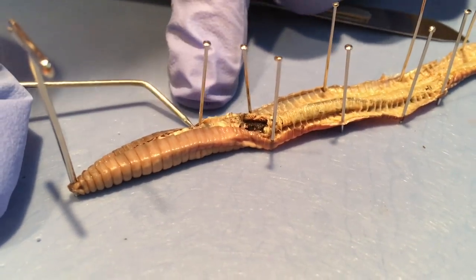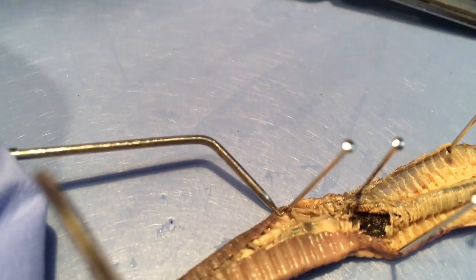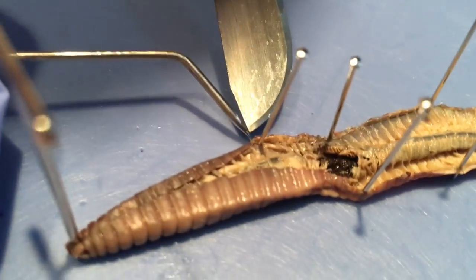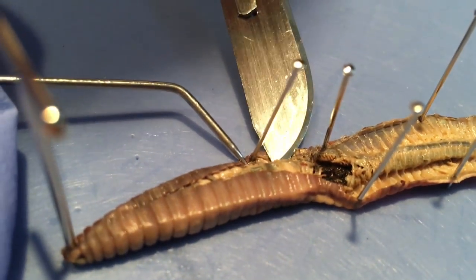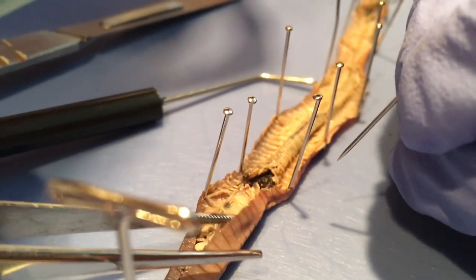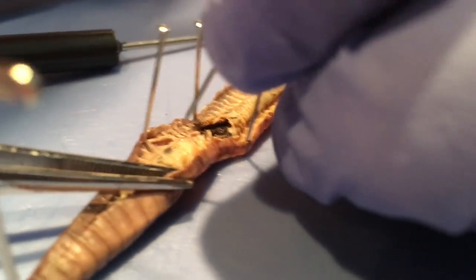Let me yank that back. Look at all that — that's where the main parts are. I have to be so careful where I'm putting this scalpel. I think I might have cut one of the hearts. Cut his heart.